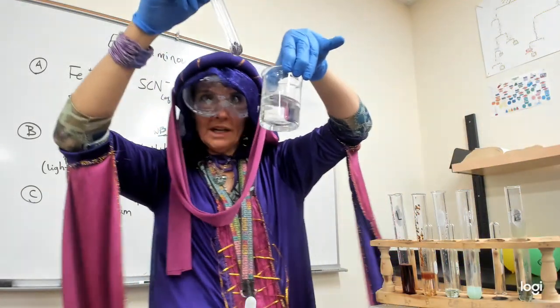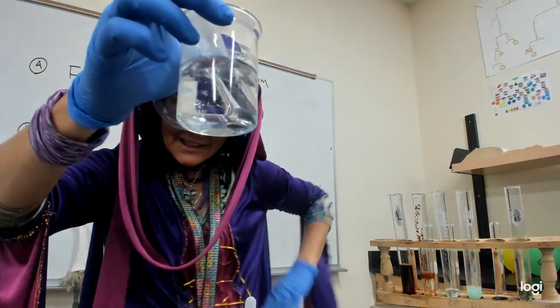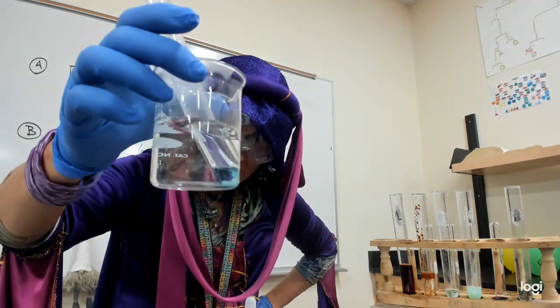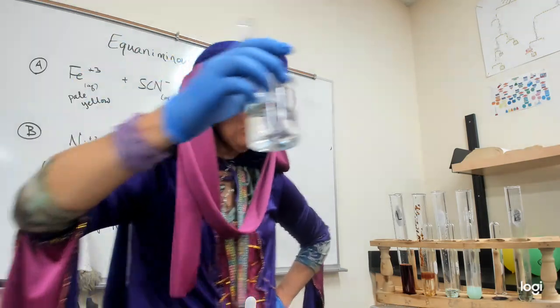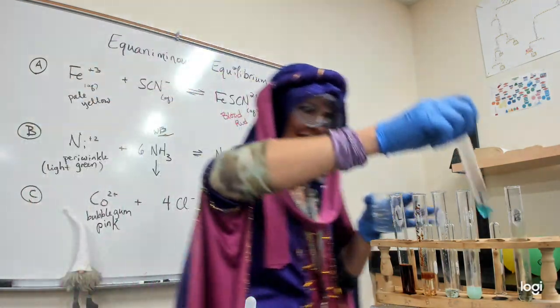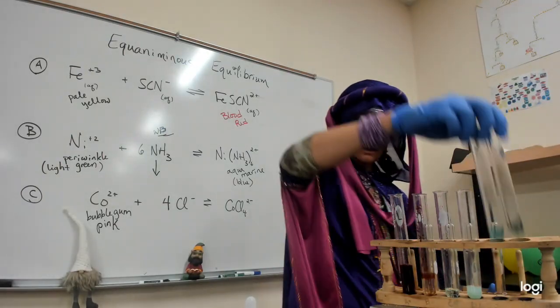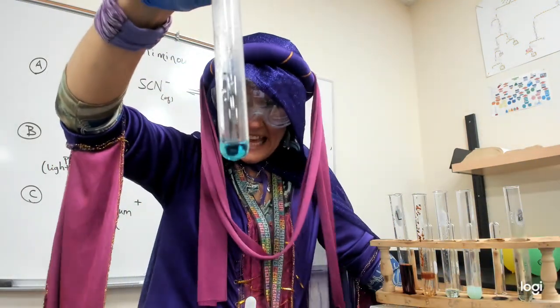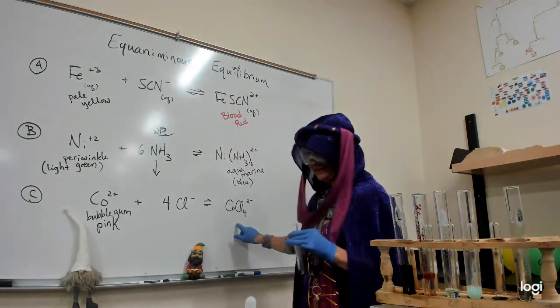So I have some boiling water here. Watch this. Hopefully it works. Oh, it's working. Can you see? It's turning blue. So apparently it's just a little chilly in here, but it's not. It's freaking warm in here. All right. So look at that beautiful blue color. That was part of the next question. So, yeah, that was the one that I kept adding and adding. Look at that. It's beautiful blue. That's the color of this.